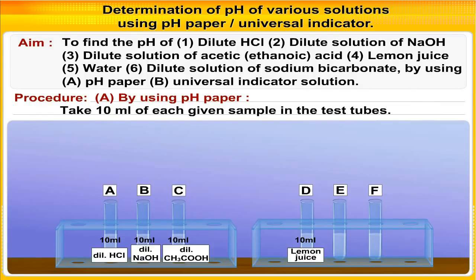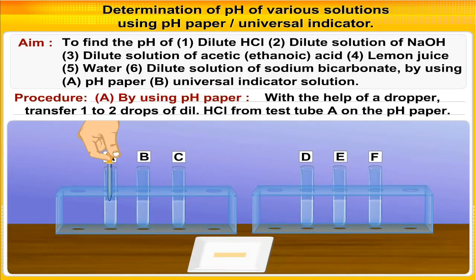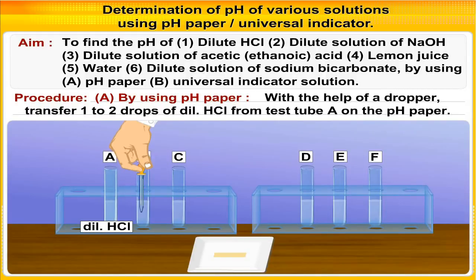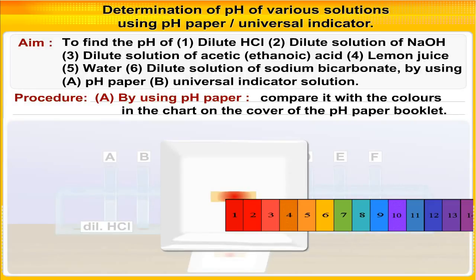Take 10 ml of each given sample in the test tubes. Now place a small piece of pH paper, about 2 cm, on a white glaze tile. With the help of a dropper, transfer 1 to 2 drops of dilute HCl from test tube A onto the pH paper.